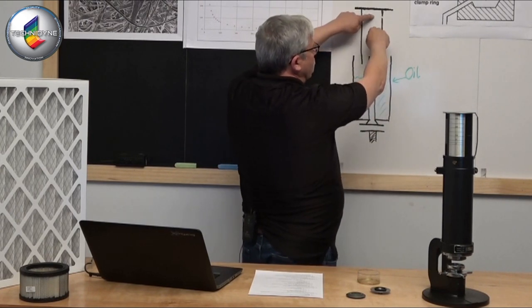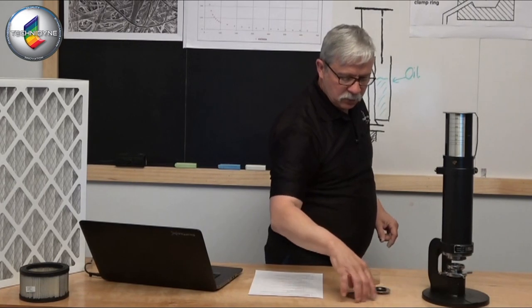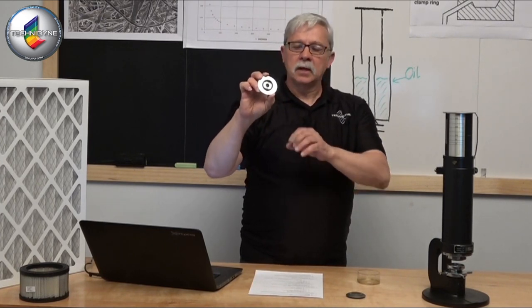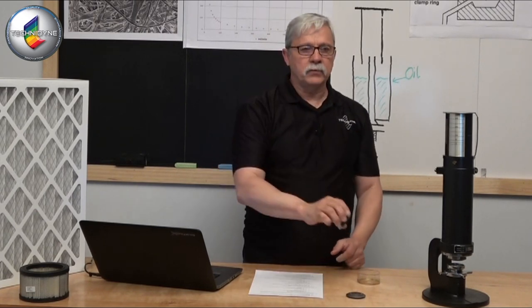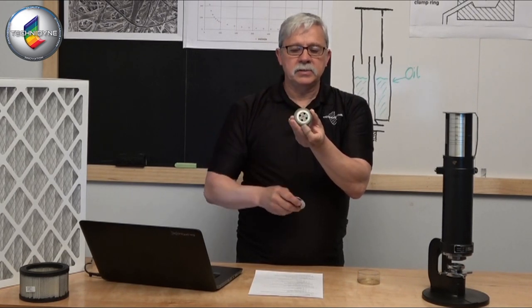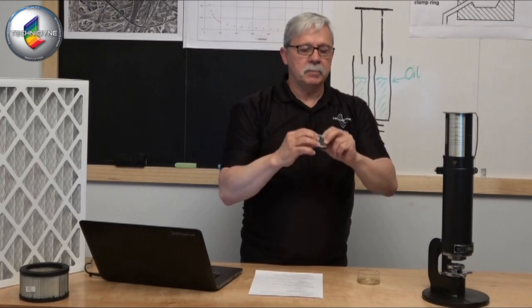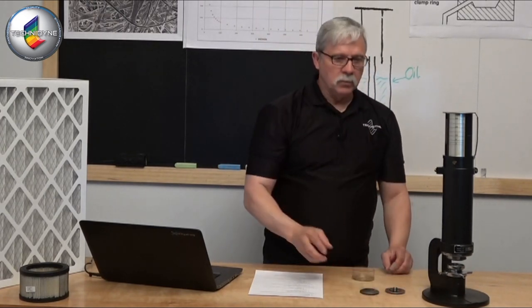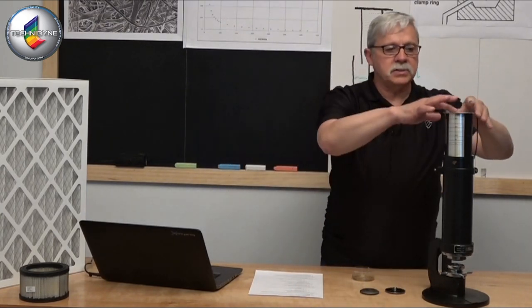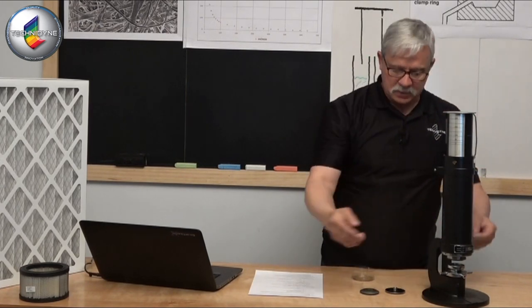So now that air pocket can be pressurized, forced through a center tube that's designed into this cylinder, out the bottom to the clamping mechanism, which is this device here, annular rings to define the area that I want to force my air through. And I'm clamping it to this device, which has perforations around the inside. So when I capture my sample, and I'm pushing air through this direction, it's going to be able to evacuate out the bottom into atmosphere. That's how we generate our pressure inside this cavity. As this cylinder, because this is a weighted top, as this cylinder drops into the outer cylinder, now I create that pressure drop from the top side of my sample to the bottom side of my sample.